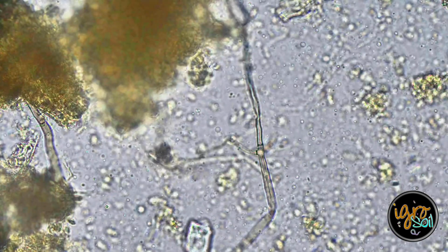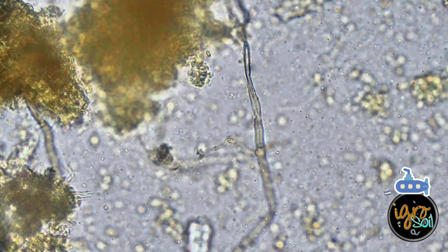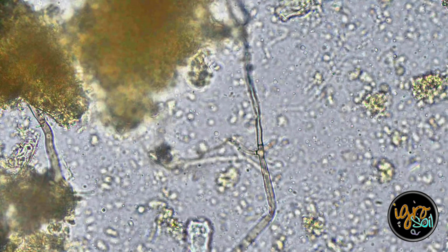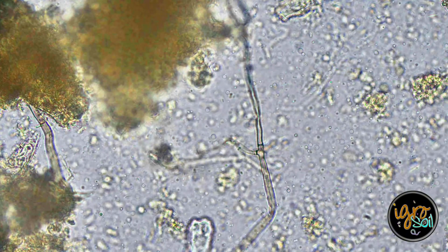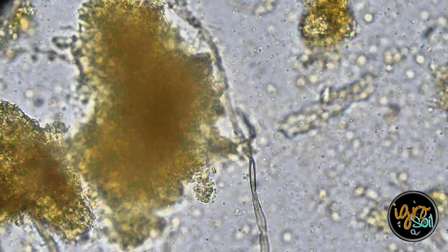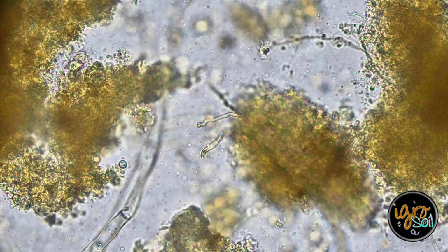But as I'm going deeper, because these are levels, right? There's depth to this slide. I'm seeing yet more septa, just revalidating. There's my little septa separation. That's the way I remember that. And this is the difference between a good compost and a bad compost.